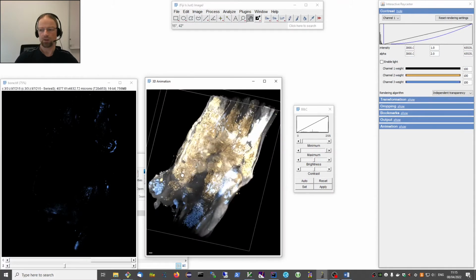And so now what I would like to do in the first part is we'll go through this second window here and see all the parameters so that you get a good overview of what is possible in 3Dscript. You can see that this window is subdivided into several panels. Most of them are actually hidden at the beginning to not overwhelm new users, and only the first one is shown. And that's also where we will start now, and maybe we will start with these sliders here.